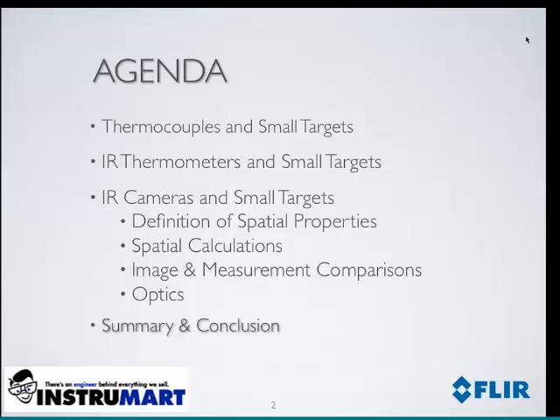More specifically, we'll define the different spatial resolution properties, so we have an understanding of what those terms and what those different parameters are. I will then take you through some spatial resolution calculations to show how you can calculate whether or not you're acquiring enough information with the infrared camera to accurately report temperature information.